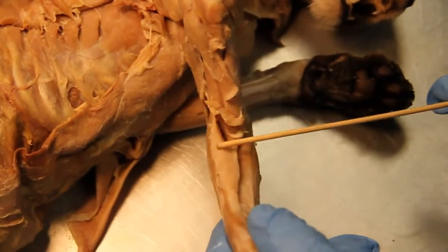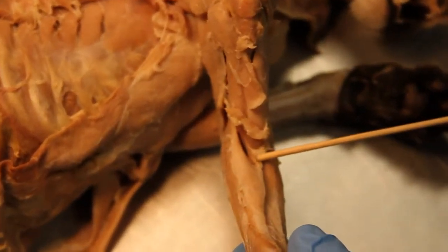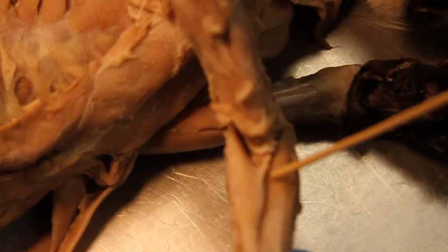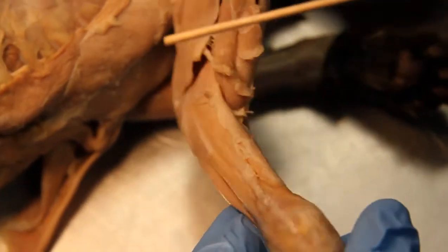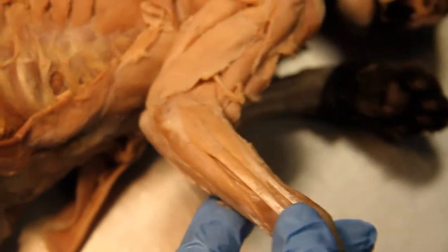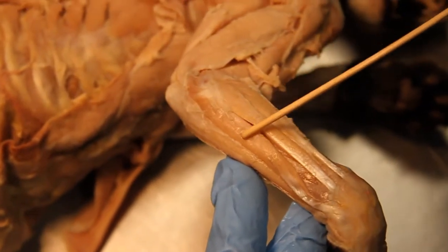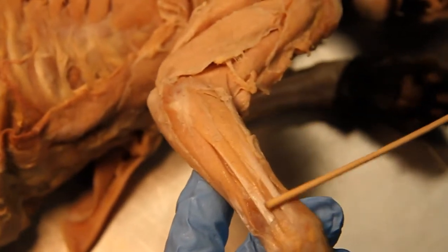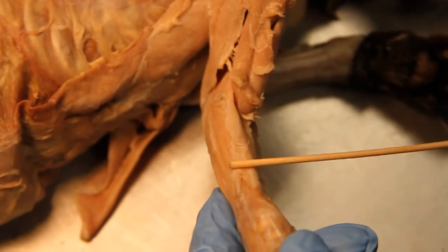We have the brachioradialis. The pronator teres. Which part is that exactly? The pronator teres — right there. Now in comparison to the last one, the brachioradialis is right there. And so here we have the extensor carpi ulnaris, the digitorum longus, and then we have the extensor carpi radialis.